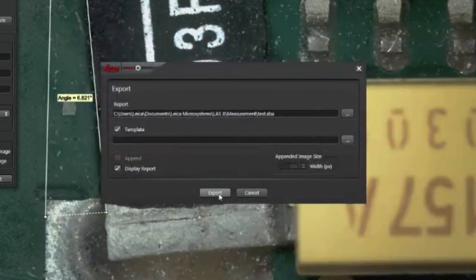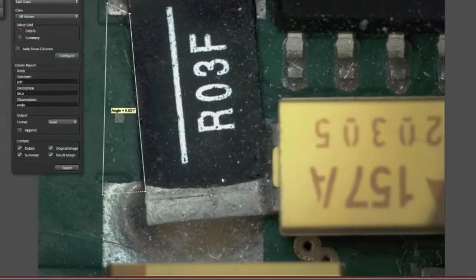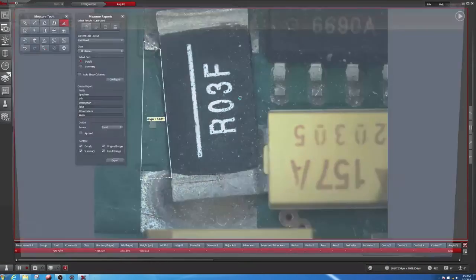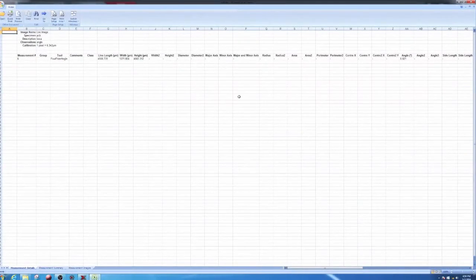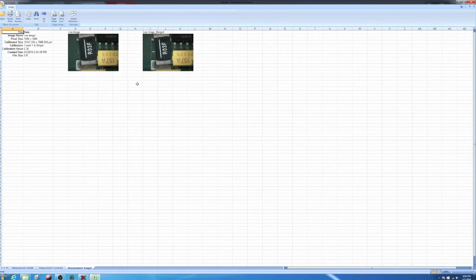If you don't choose a template, you simply get an Excel report with all the measurements, the measurement summary, and the images with the angle.